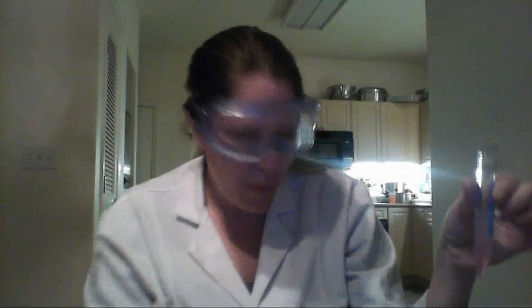And I'm just going to let this sit for a little bit. You can get another empty glass if you want. I got an empty glass sitting here, so I'm just going to use this just to hold this and keep it from spilling. So I'm just going to set that there for a sec. And I'm going to go get my ice cold ethanol from the freezer right behind me, so I'll be right back. Okay, so here is my ice cold ethanol.